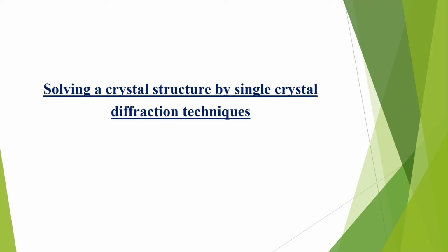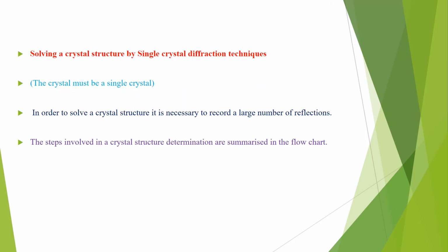Solving a crystal structure by single crystal diffraction technique. So, to solve a single crystal structure by the diffraction technique, the crystal must be a single crystal.